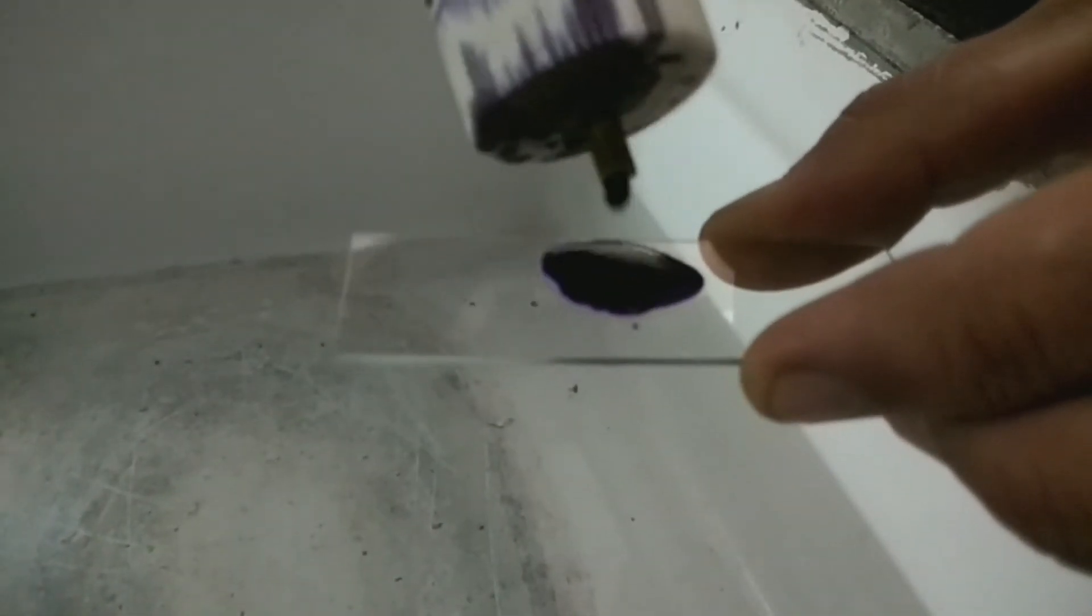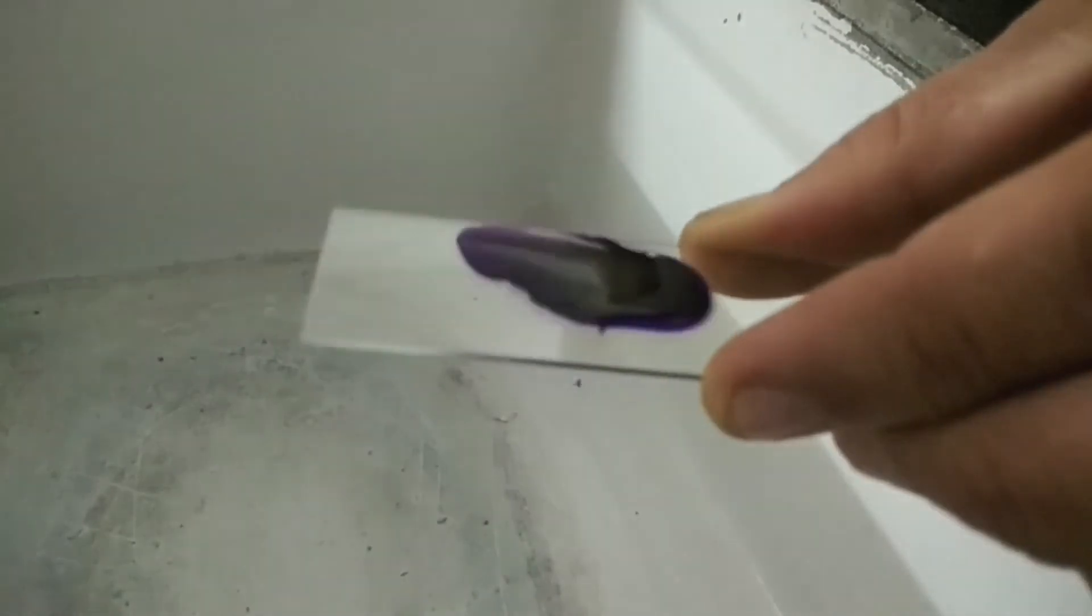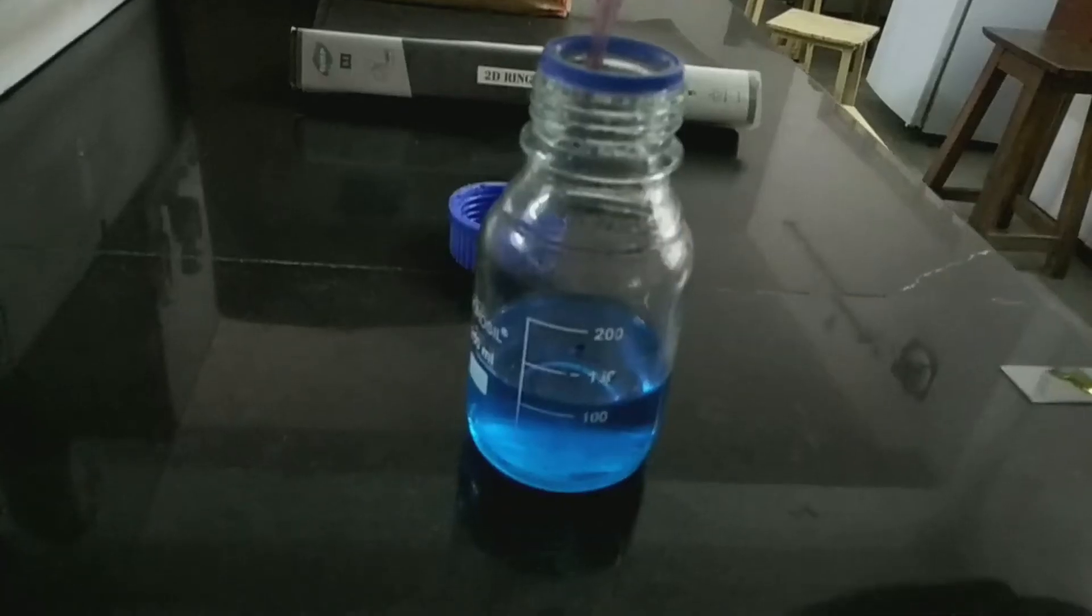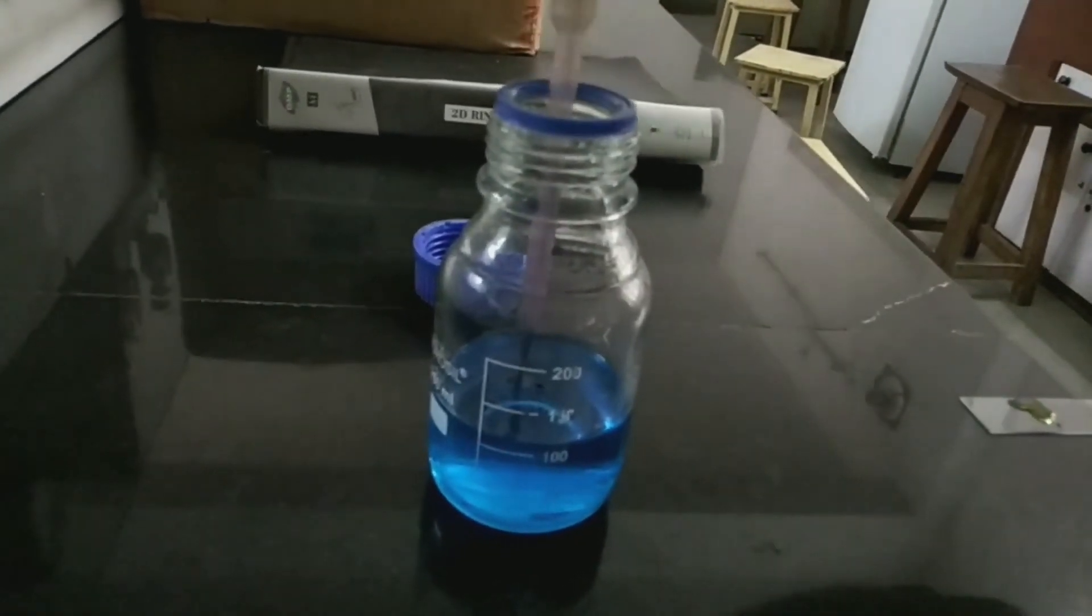Now you just have to stain the smear with the crystal violet for one to two minutes and wait. After that, you just have to decolorize the smear with the 20% copper sulfate.